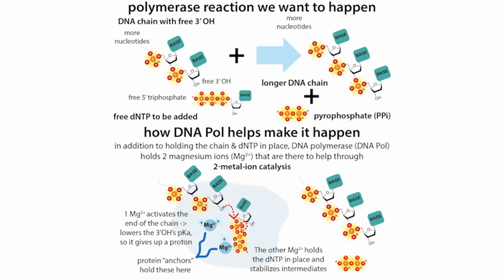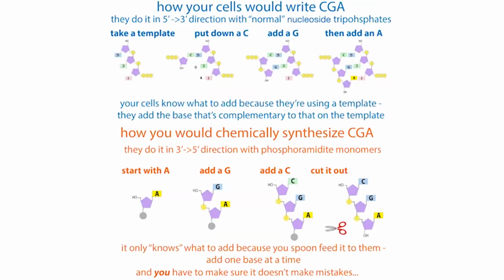If those molecules were just freely floating around, you're not going to have these random reactions happening in your cells, because the concentrations aren't great enough and they're not in the right orientation to react in just the right way unless they have the help of that enzyme. So if we want to get these DNA letters to join together without the help of that enzyme, now we're going to need to bring them together. We're going to have to flood them with high concentrations, because you don't have them all being brought together by this enzyme. And we're going to have to use these kind of extreme conditions, with things like acids that would not be good to happen in your cells or even in your PCR test tube.